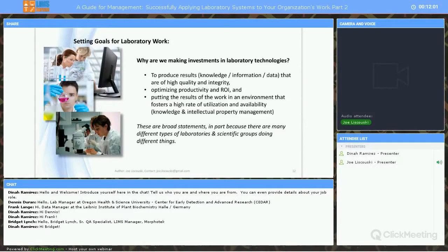There are goals that your lab has for their scientific mission. They may speak to the nature of the research you're doing or how the QC lab is going to support a production process. The goals referenced here are those that pertain to the use of informatics and automation technologies within those environments. It will be useful as part of both a project's justification and evaluation to see how what you do affects these goals. And these are the goals I'm suggesting.